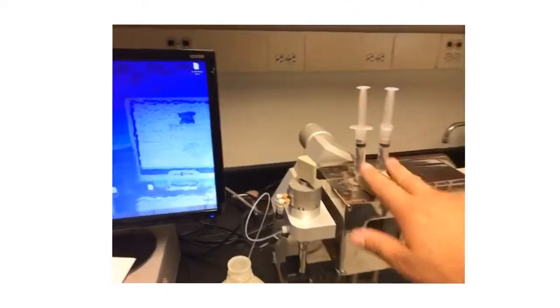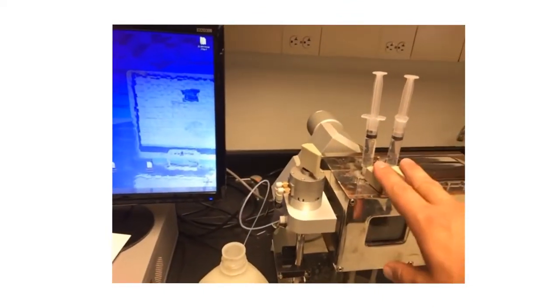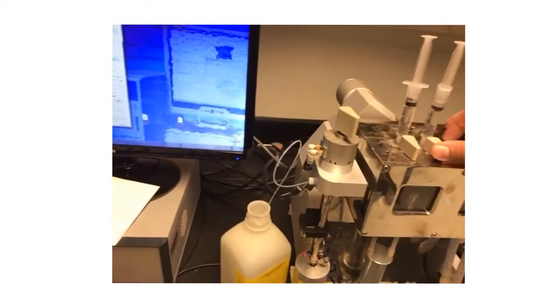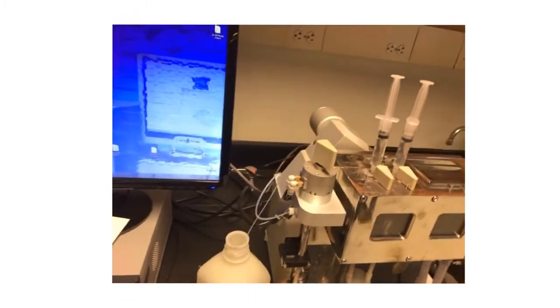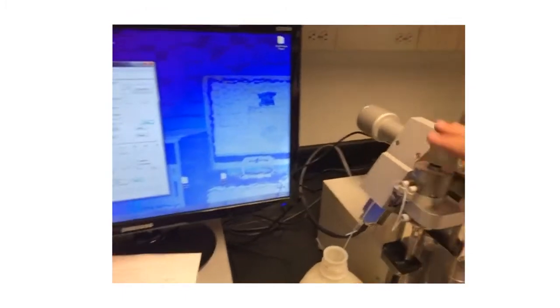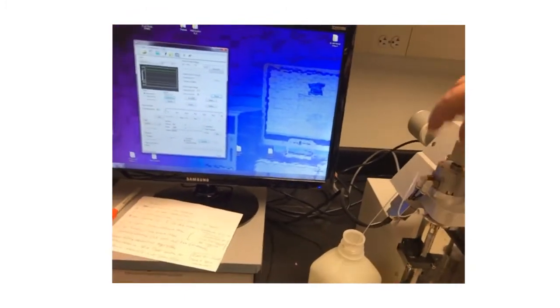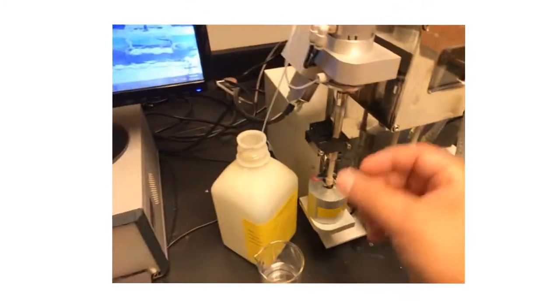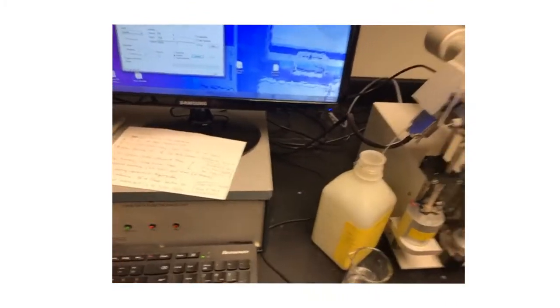So some of the keys are, if you're adding reactants, you better be locked here. So these should be pointing right at you. That means locked. This is unlocked. Bad. Locked. Good. And then here, pointing at you is good. So pointing away is the draining. It allows you to drain. And then flip back, it allows you to refill.